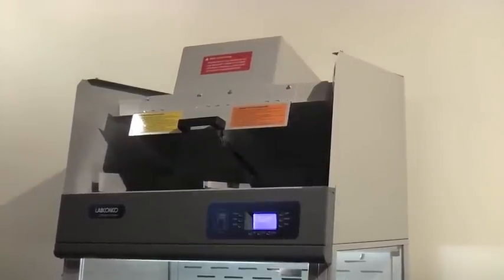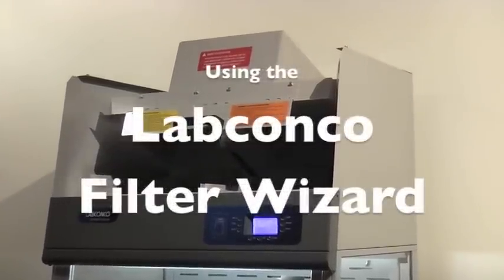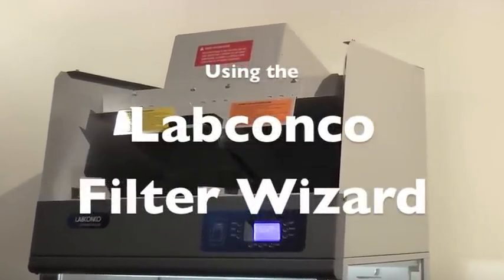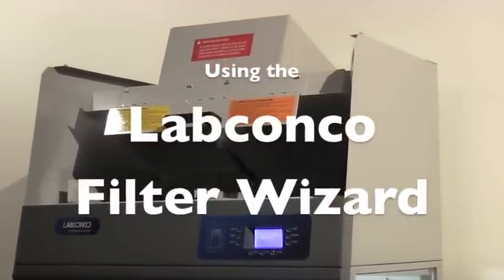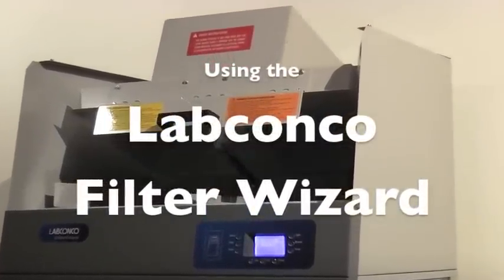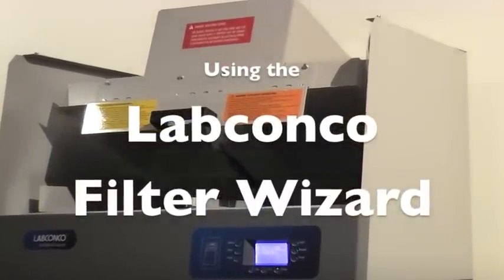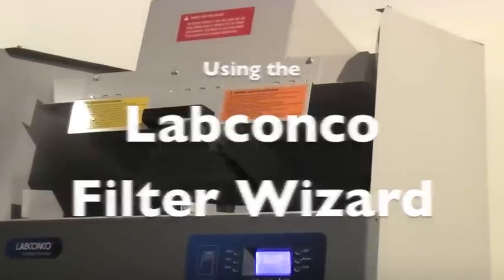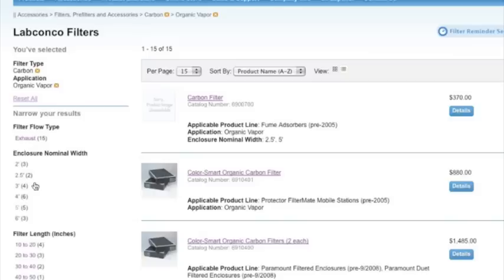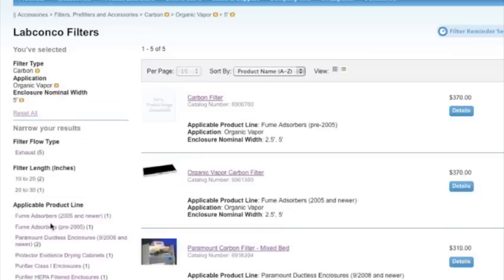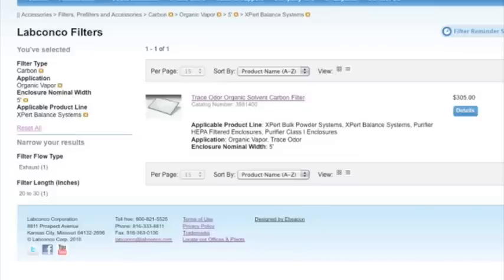With the variety of filters available, finding the correct replacement filter for your piece of equipment can seem like a daunting task. To make it easier, LabConco created a filter wizard to help you find the filters you need in just a few simple steps.